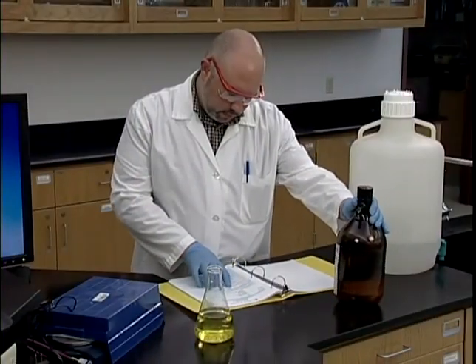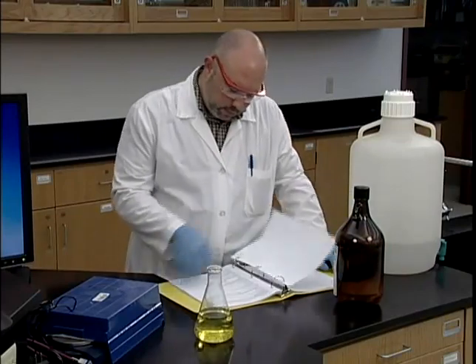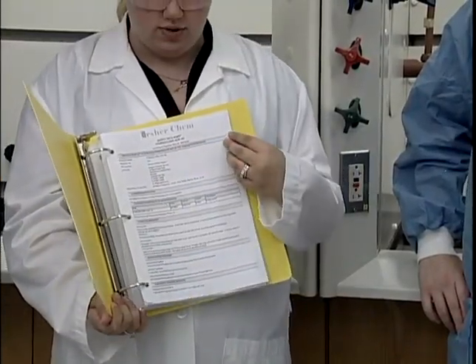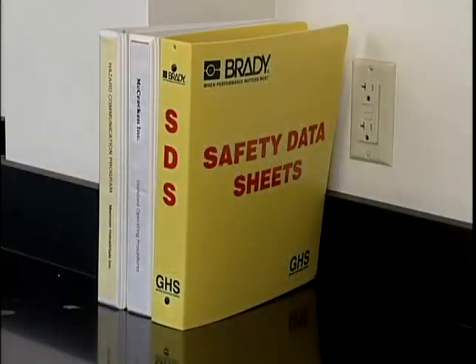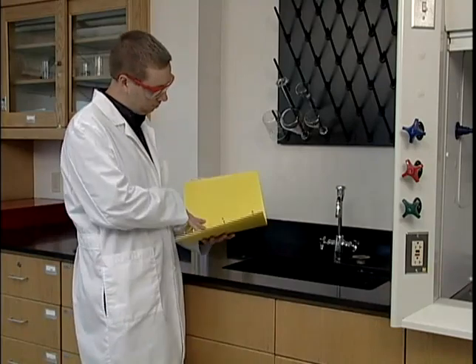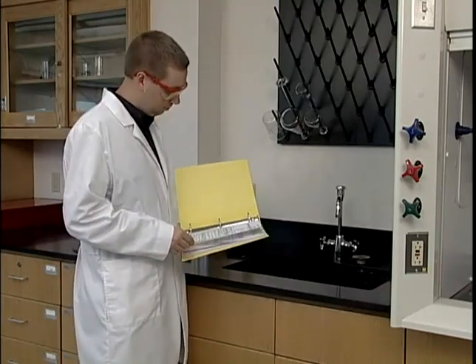GHS safety data sheets are a valuable tool for working with hazardous chemicals, and understanding them will help you to do your job safely. So make sure you know where the SDSs are in your laboratory and read them before you use any chemicals that you work with.